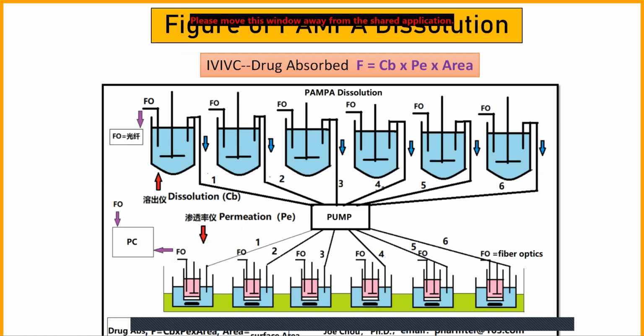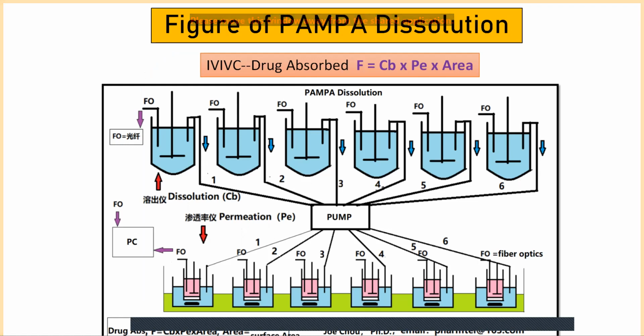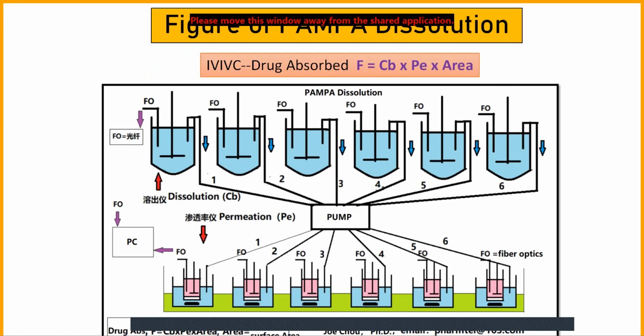As you see from this figure, this is the so-called PAMPA dissolution. On the upper part there are 6 dissolution vessels, and on the lower portion there are 6 PAMPA vessels corresponding to the dissolution vessels. In the middle there is a pump. As we just described, all the media follow the pH we mentioned.